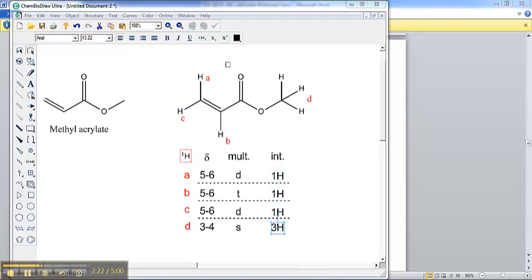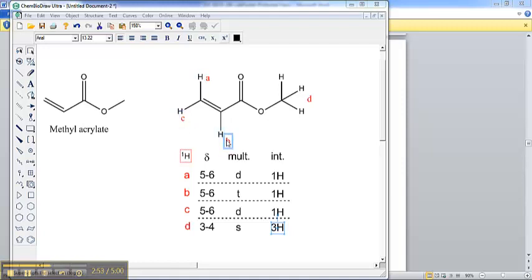The splitting, the J values, the multiplicity — that's going to be quite a bit more complicated. But it is easy to see that D has no neighbors; there are no protons anywhere near D, therefore it should be a singlet. If you look at A and C, you notice that they are on the same carbon, which means they won't couple to each other very much in general. So you might consider that A is simply going to be a doublet based on B, C is simply going to be a doublet based on B, and B is going to be a triplet because it is coupled to both A and C. So ahead of time, that might be what we would predict for this structure.